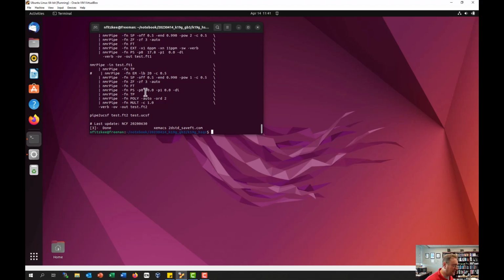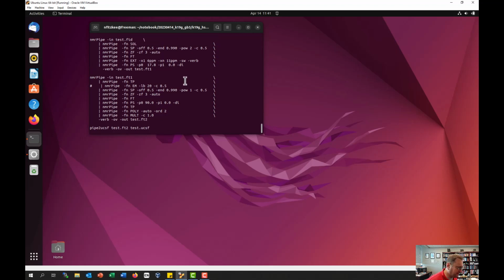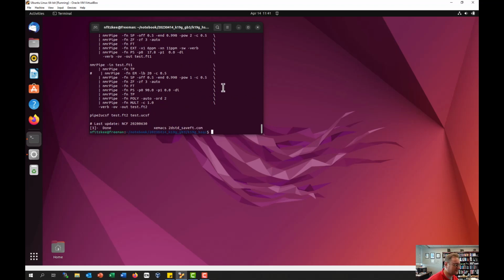You can dig that out from Topspin, but this is very clear, and it also lends itself very well to scripting. If you've got 1,000 spectra to process, you can set this up as a script, and they're all processed exactly the same way. And prior to that, we looked at how you copy the data over in the first video, and actually talked about the NMR spectra themselves.